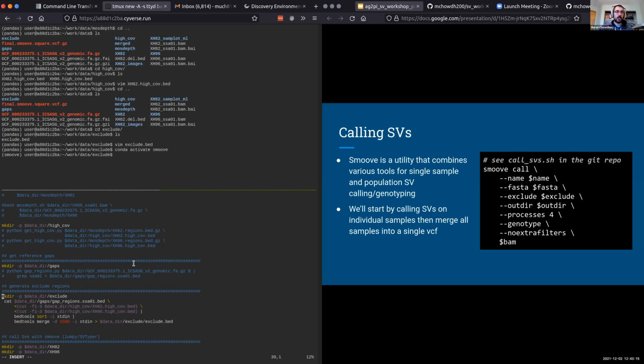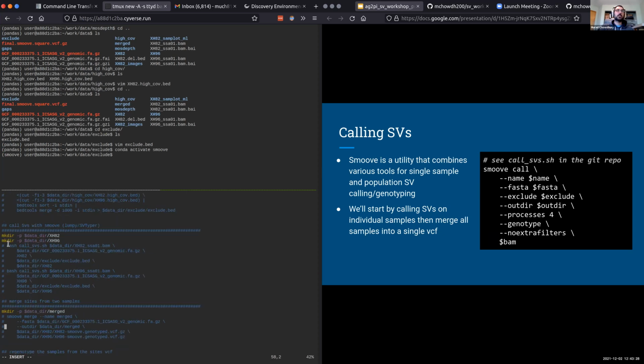So first, I'm just going to go through and recomment some of this existing code. And then over here, we're going to uncomment this. I'll just uncomment one, but I'm not going to actually run this at the moment because it will take a little bit too long in the context of what we're doing. But essentially, we're just running this once for each sample.